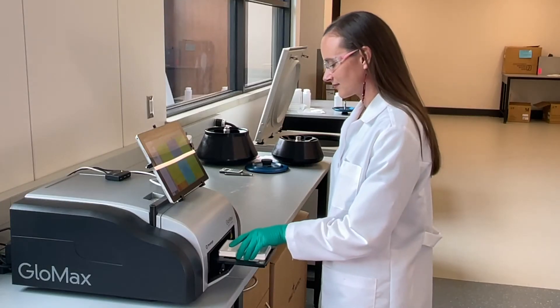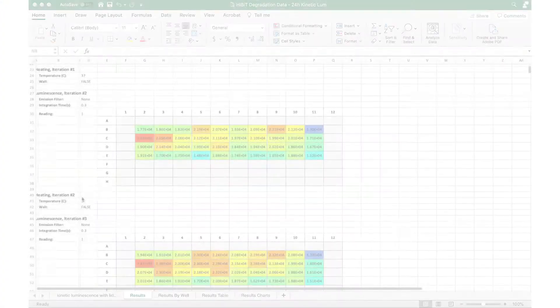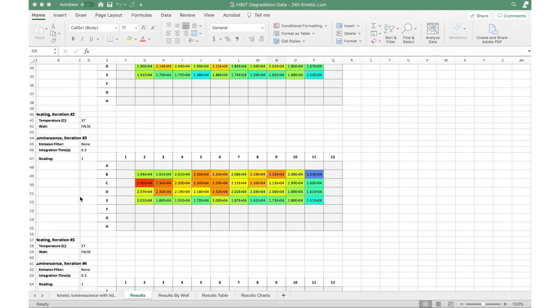When the run is complete, I collect the plate. I've set the instrument to automatically export my results so I can easily view and analyze the great-looking data from my office.